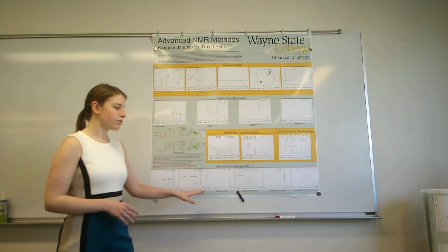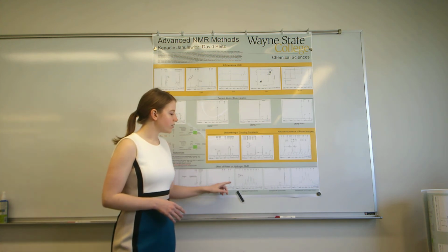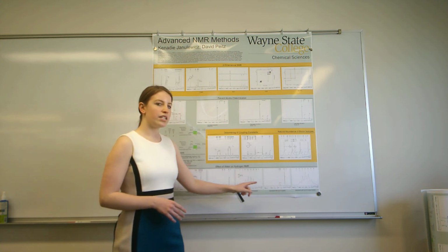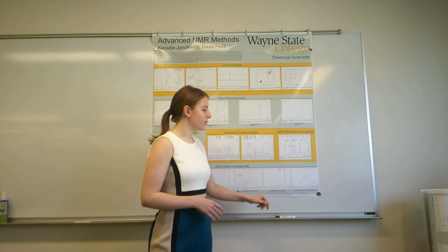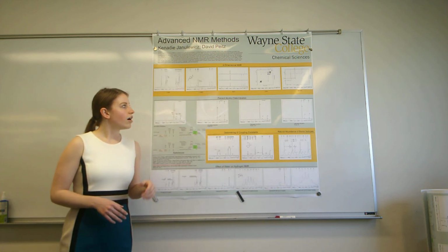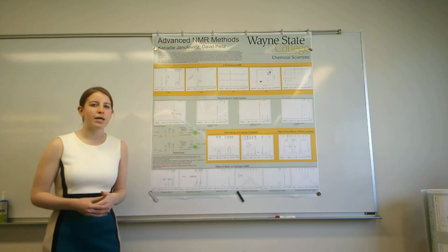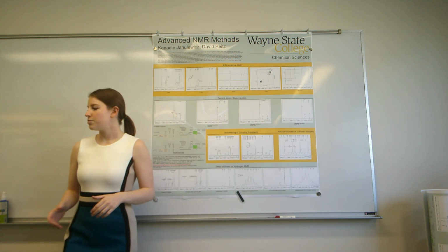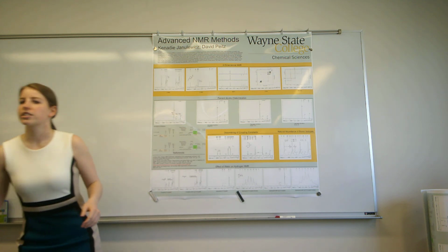We did the same thing with isopropanol. When we ran it dry, we expected to see our heptet of doublets, and when we ran it with D2O, where the alcohol doublet was taken out, we only see our heptet. All of these experiments and several others were typed up into worksheet format and compiled with the raw and interpreted data into binders for students to do similar experiments.